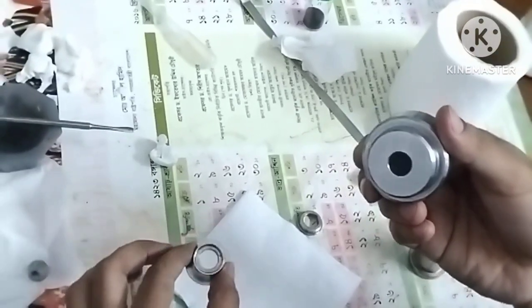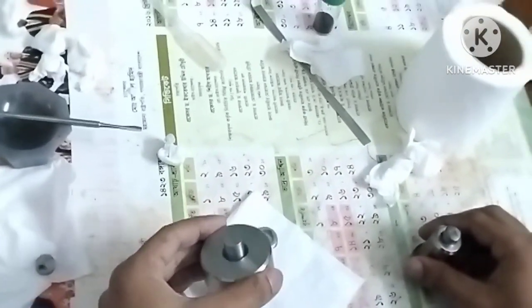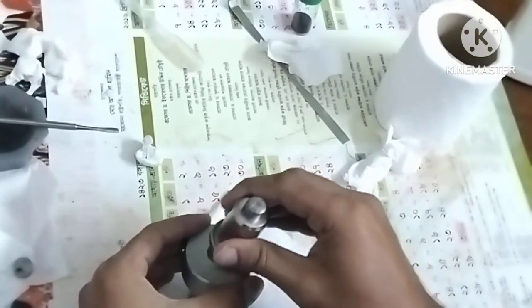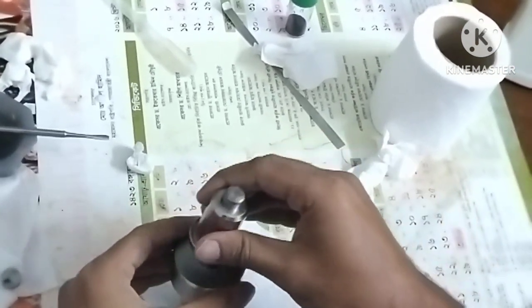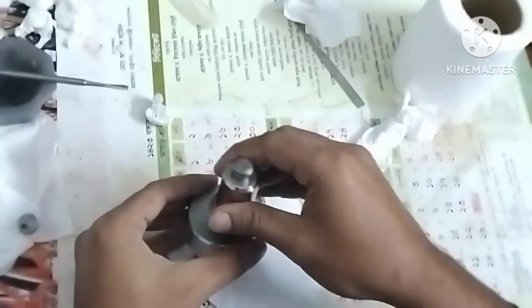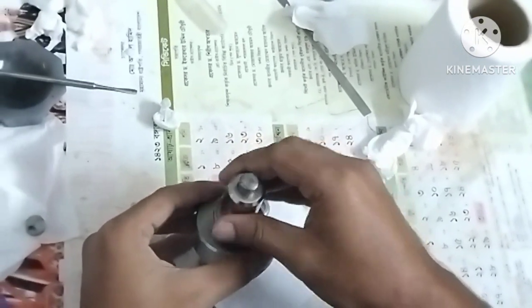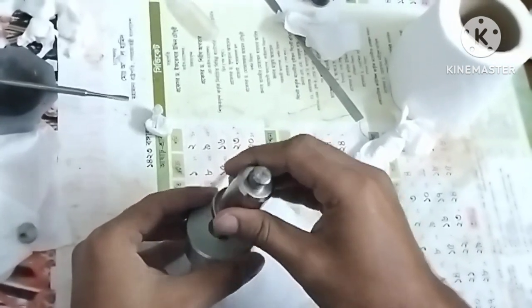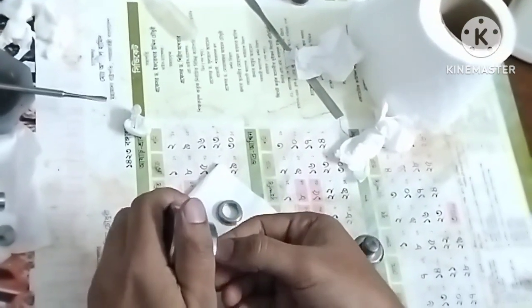When we separate this KBr plate, we have to keep in mind that we must separate it carefully, otherwise if it is broken, we will not be able to do FTIR spectrometry. So slowly and gently we will press here using this glass portion, and we see that it is really uniform.